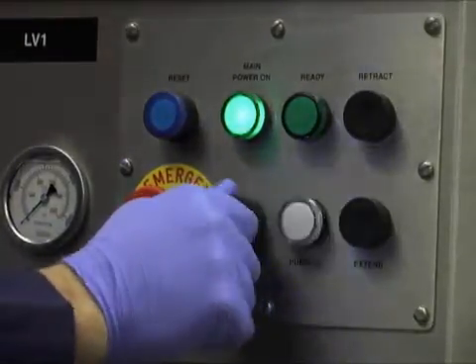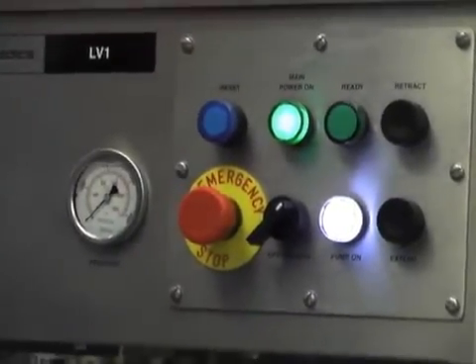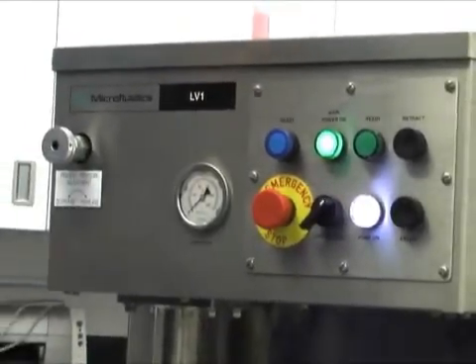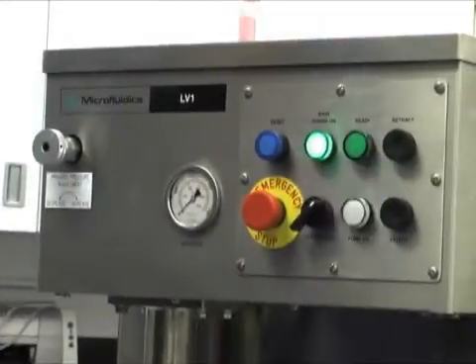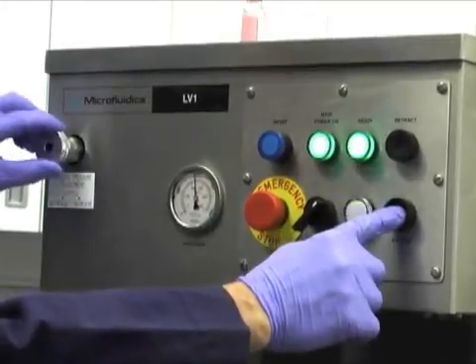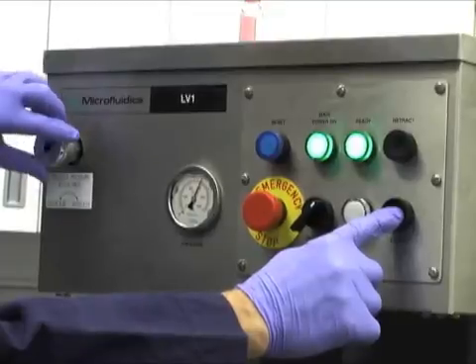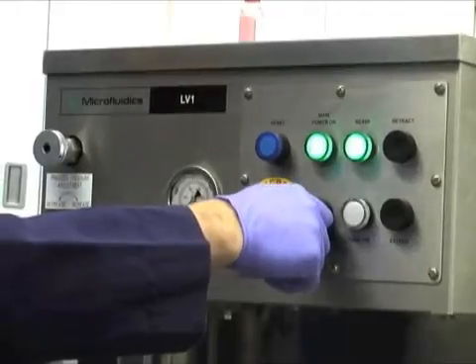Now you can set the pressure level for the equipment. To do this, first turn the three-position switch from off to the run position. The ready light turns on. Hold in the process button and turn the pressure control knob until the gauge reads the desired set point pressure. Then release the process button and turn the switch to jog.